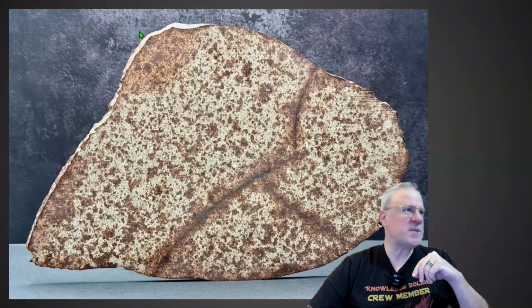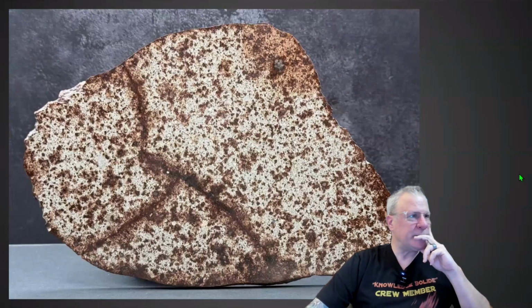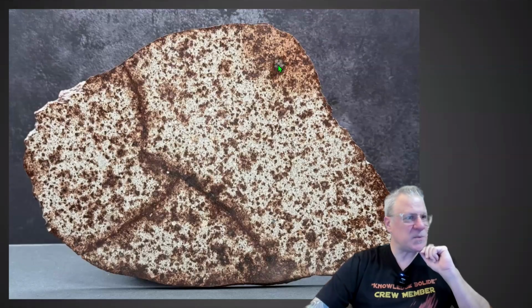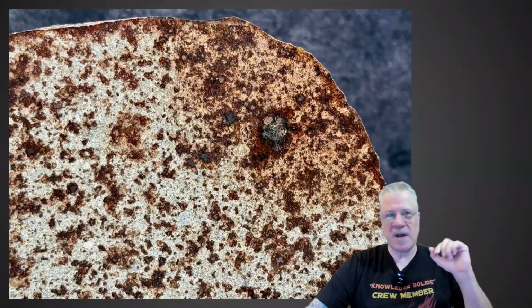Plus, if you notice up on this top, we have some discoloration. I'd like the crew to be able to talk about that. In here is a big metal bleb as well. I think Marissa's slice has the biggest metal bleb of any of these, so we're going to get a measurement of that for you as well.